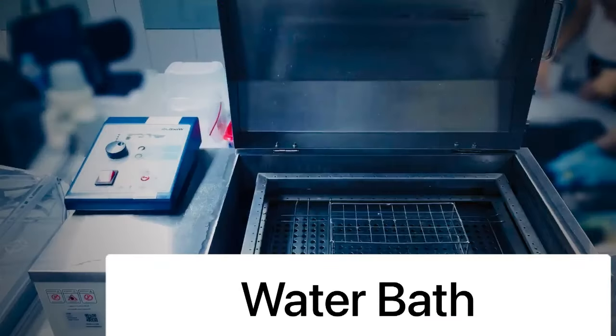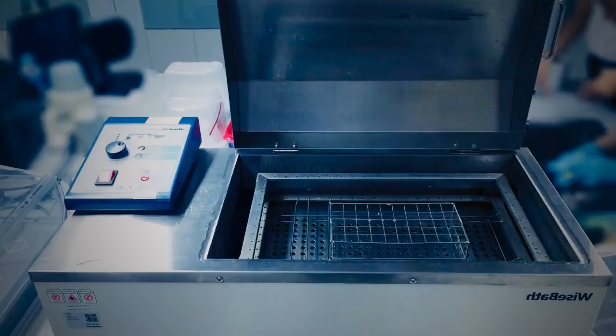Water bath. A water bath is a device used in laboratories to incubate samples in water maintained at a constant temperature. Temperature may be controlled digitally or by a dial, and once set, the water bath cycles on and off to ensure constancy of the temperature.